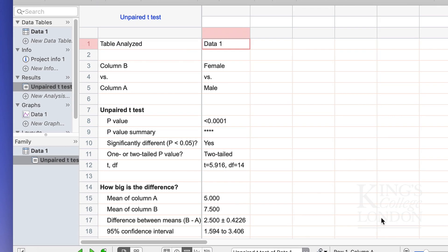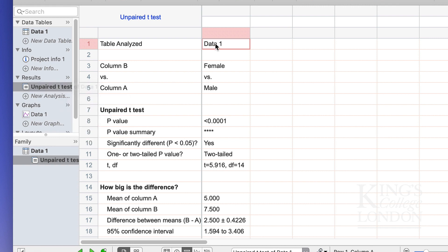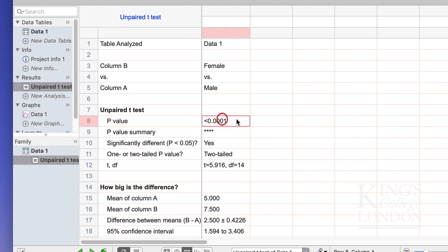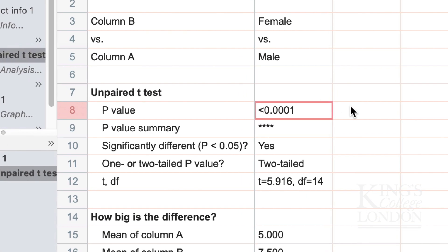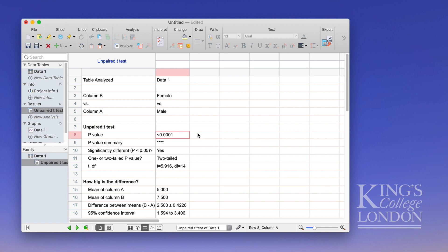Automatically I get an unpaired t-test table in my results section and I can look down through these data at my p-value summary of my unpaired t-test and see that my p-value is less than 0.0001 showing that it is highly significant. So that's a quick and easy way of doing an unpaired t-test in GraphPad Prism.